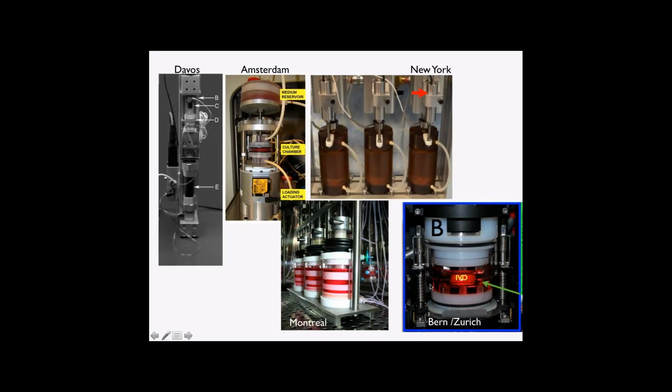You can see here the design of these two that came out almost at the same time. This is now glass, easy to see, where you have contamination as an advantage. We get rid of all the tubing in our case because we refresh the medium every 2 days. We wanted to make sure we have a good surface for no slippery effect from the application of torsion.